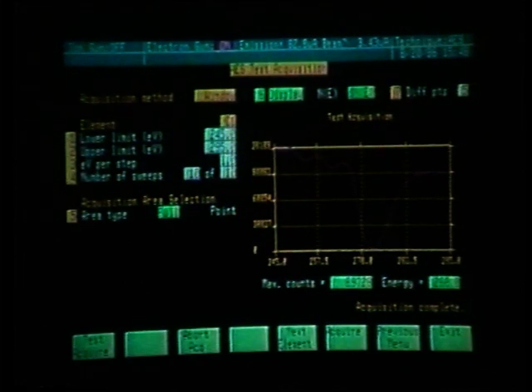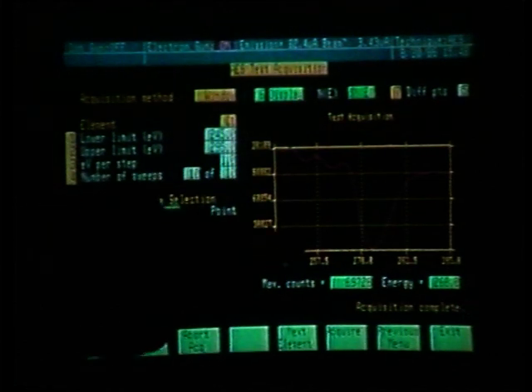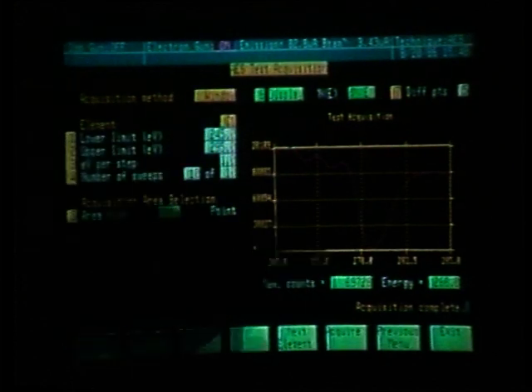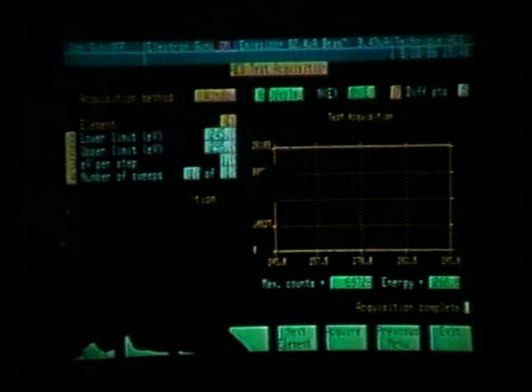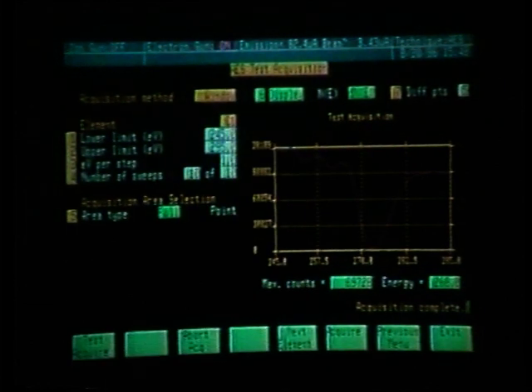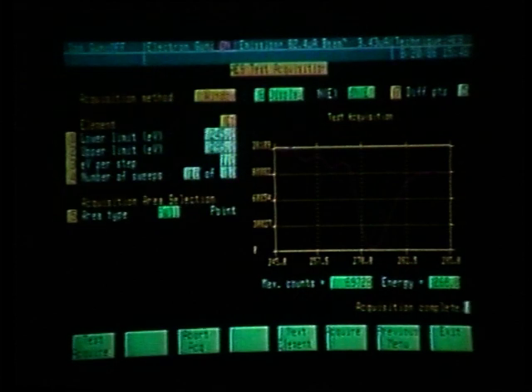Notice that if we would have used the narrow acquisition parameters, they were from 257, we would not have included our positive most excursion. Thus, we would have gotten an improper or an incorrect atomic concentration calculation. It would have calculated using this peak-to-peak height, but it is not representative of the true amount of carbon on the surface of this sample.